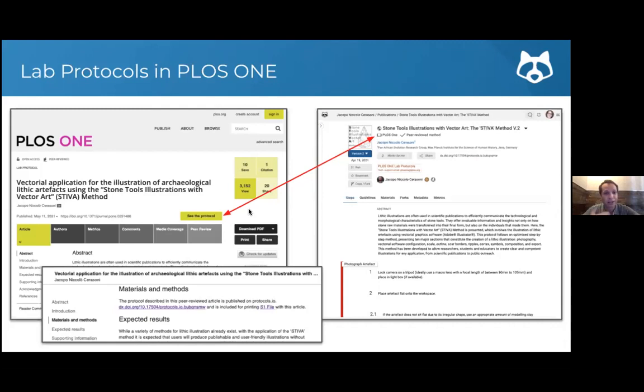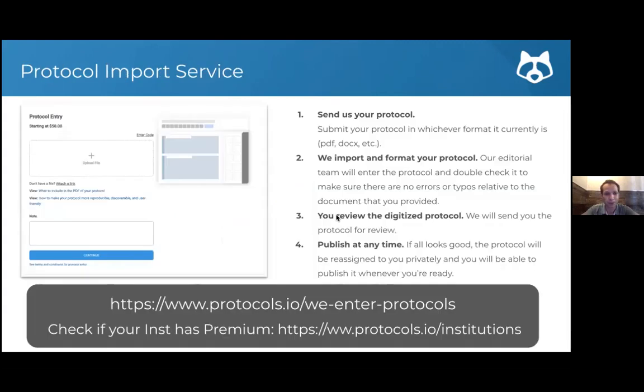And again, it's not just then a PDF paper, but all of the features that we just went over with the templating, the commenting, the ability to version and run makes it a perfect combination of a peer-reviewed paper and a runnable, dynamic, and interactive protocol.